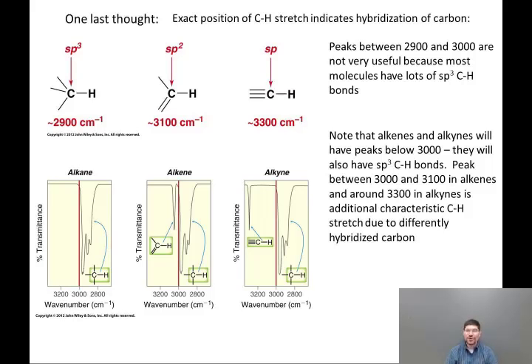Okay, so I have by no means gone over every detail of how to interpret an IR spectrum, nor do I intend to. For this introduction to IR spectroscopy, all I was trying to do was to show you the major functional group stretches, show you some pictures of spectra so you can actually see what they look like. So when you acquire spectra in lab, they will make some more sense to you, and to tell you which functional groups you need to be focusing on the most.